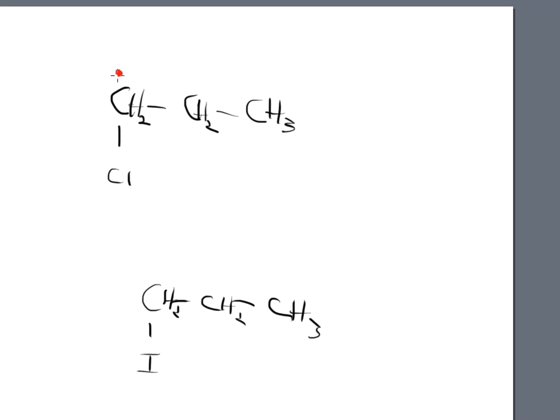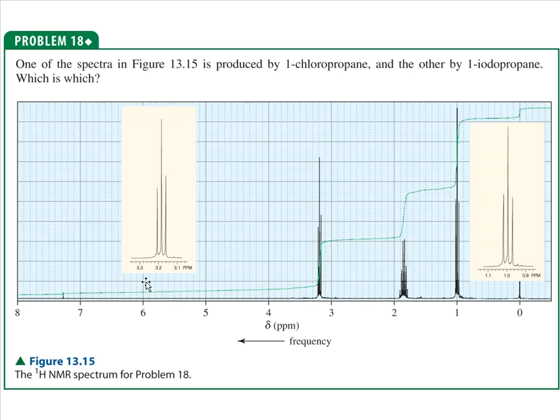This is a signal. This is a CH2, but there's no chlorine on it. So that's a different signal. And then that's a CH3. No other CH3 groups are here, so that's automatically its own signal. So we get 3 signals there. Just the same as we would get 3 signals here. 3 major signals in the NMR. And that's what we're seeing in each one of these examples.